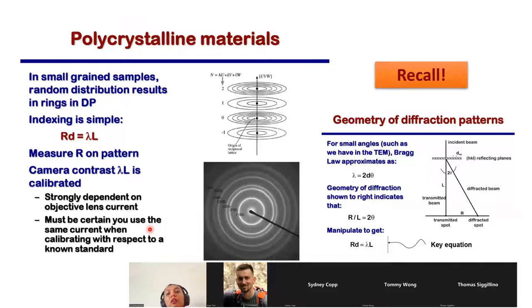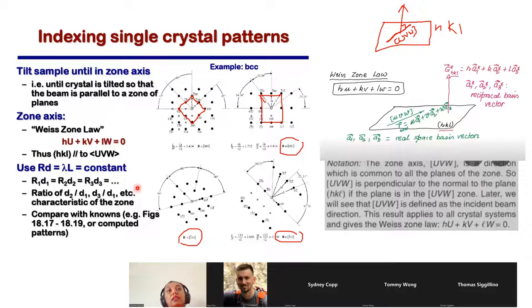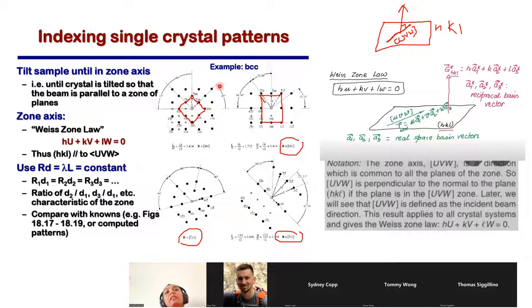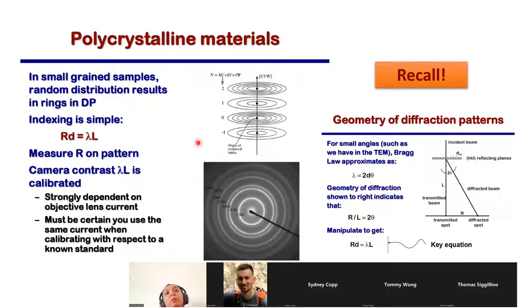Now, this is the basis for your microscopy. This is what you would see, and this is what you would play with. Most of the study is about indexing single crystal patterns. Now, going to the polycrystalline material, what is happening there? In the polycrystalline material, there are multiple crystals and multiple diffraction patterns are happening. When you obtain multiple diffraction patterns, you get the superimposition of all these points, which gives you this kind of a circle. So these kinds of diffraction patterns come from a polycrystal. In the polycrystal as well, you should be able to tell what kind of polycrystal it is.